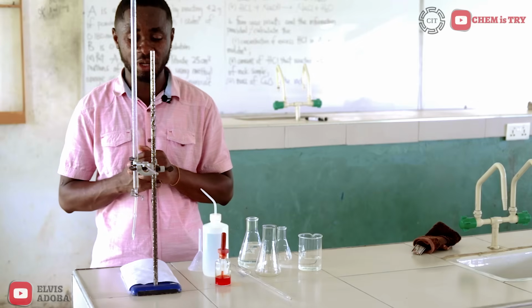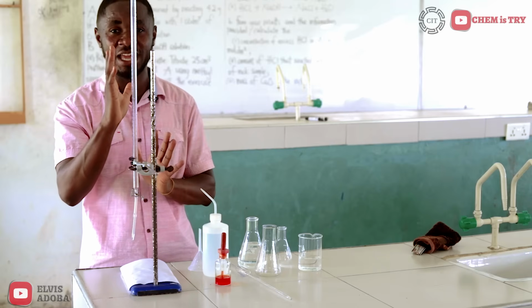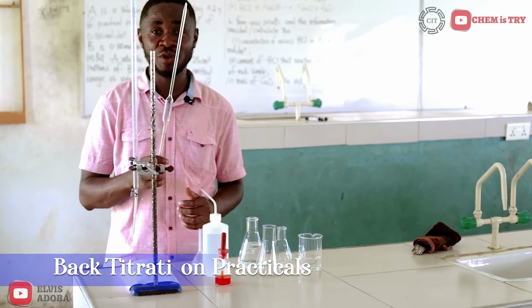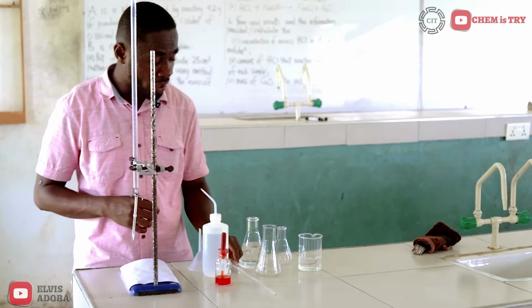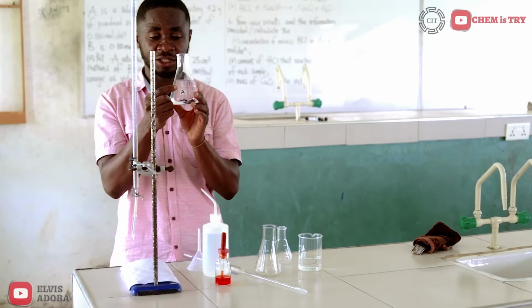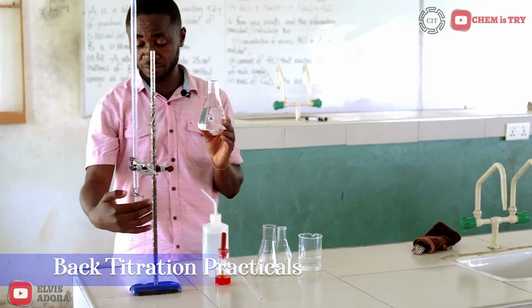Setup for our titration. I've already rinsed my burette with distilled water and with portions of solution A. I have also rinsed my pipette already with distilled water and portions of solution B. So what I do is, I'll take my solution A, you see the inscription A on it, then transfer it into my burette.